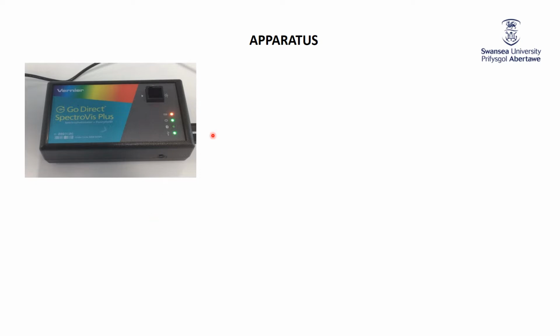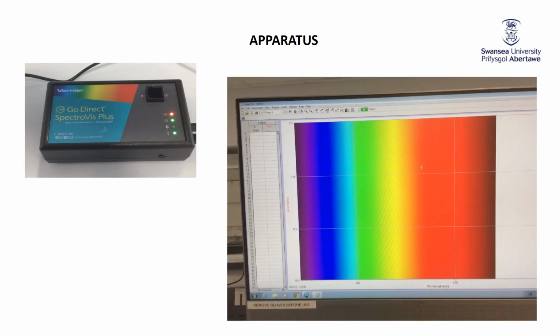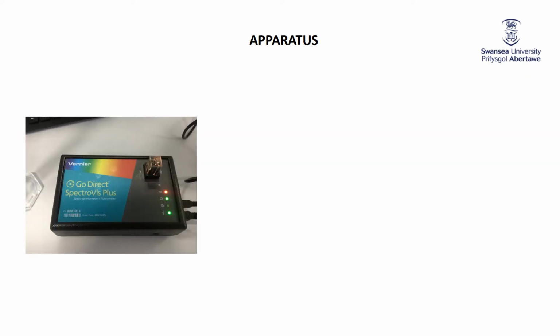If you're in the lab, you would see our spectrophotometer. It's a nice little thing. We put our sample in a square test tube called a cuvette into that hole there, and then we beam light through it. The light goes through the sample, we measure what comes out afterwards, and then we display the results on our computer screen. Here is a sample in the cuvette, and you can see it's lit up because the light is passing through. Again, light passes through, some of it is absorbed, and the rest is transmitted.